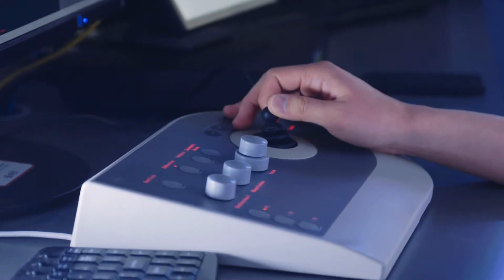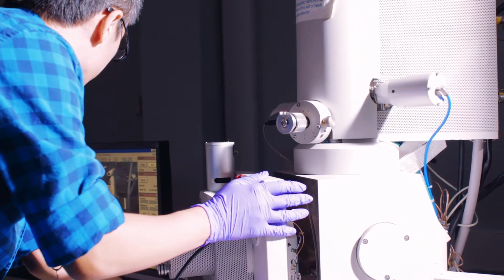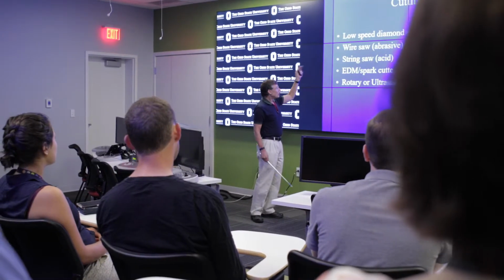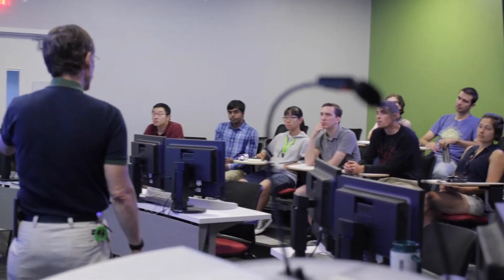The remote microscopy collaboration that we're building closes that gap that they have to be present in the facility in order to do the research that they need to do. We demonstrated that we can operate many of these tools from a remote environment, from many hundreds of miles away from CEMAS. The teaching environment that we've developed here in the digital theater, when combined with this remote microscopy capability, is giving us this very unique capability to teach the instrumentation itself to large groups of people. It's actually teaching you how to use it live.